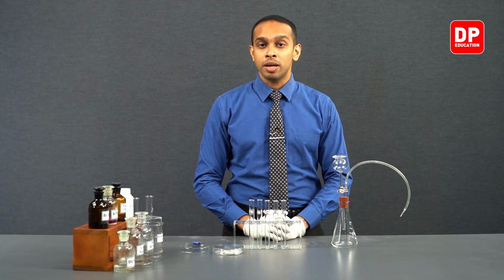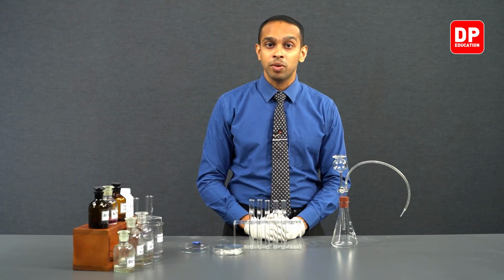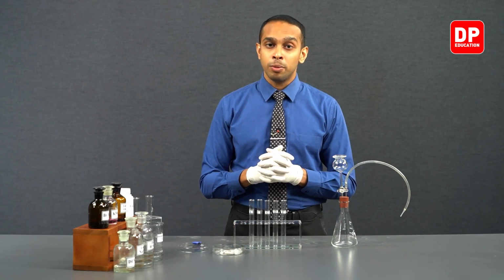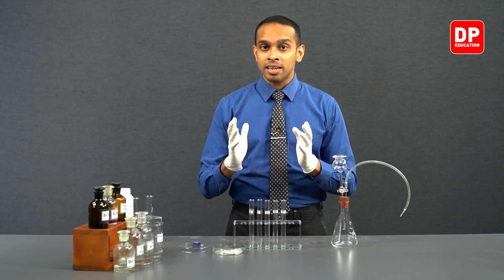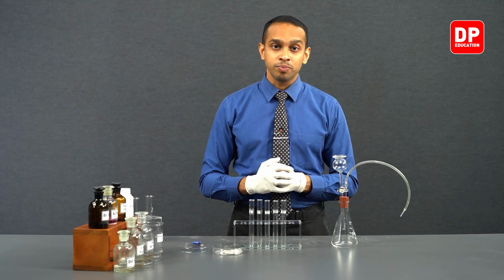Ethyne is our IUPAC name, and acetylene is the traditional or common name that we use. So it is a gas that is made up of 2 carbon atoms and 2 hydrogen atoms. So this is an alkyne. It has a carbon-carbon triple bond.